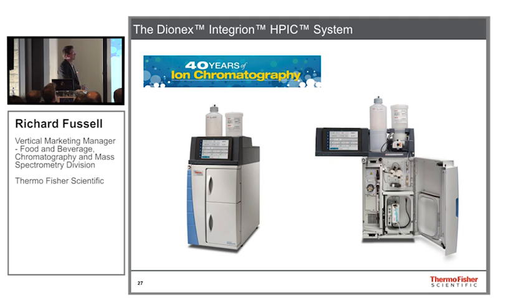And last year, Dionex celebrated their 40th anniversary. It's a bit worrying that I actually had a Dionex system about 35 years ago. So I was almost there at the very beginning. But now the latest ion chromatograph is this one, which was launched in, I think it was February. This is the Integrion system.